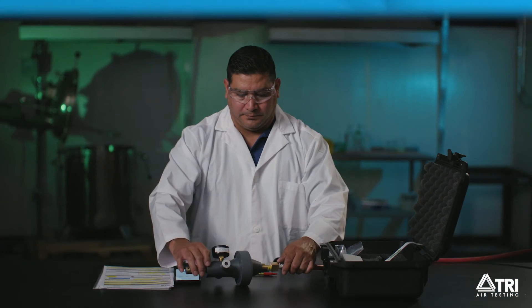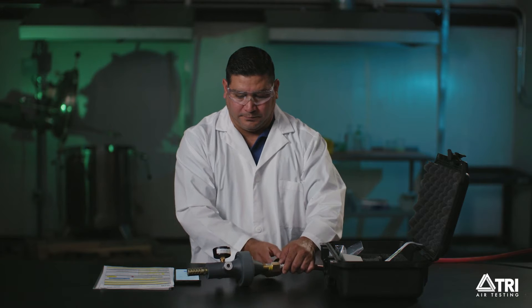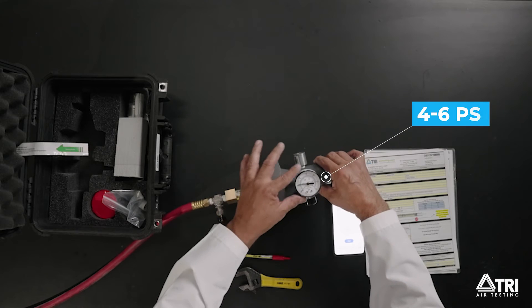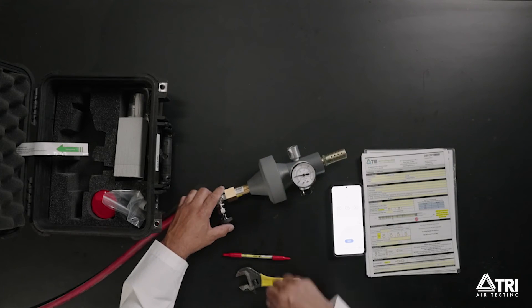Step 2. Slowly open the valve until a steady pressure in the range of 4 to 6 psi is on the pressure gauge on the Champion 35 flow section. Record the exact pressure on the datasheet under section Moisture Sample Data.